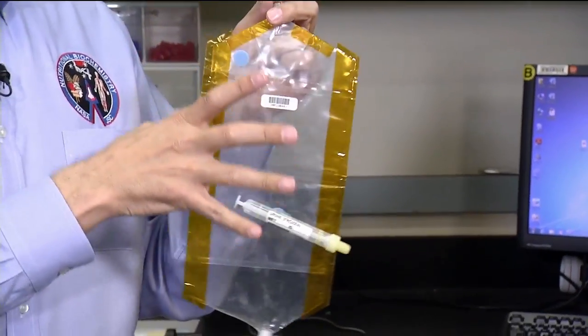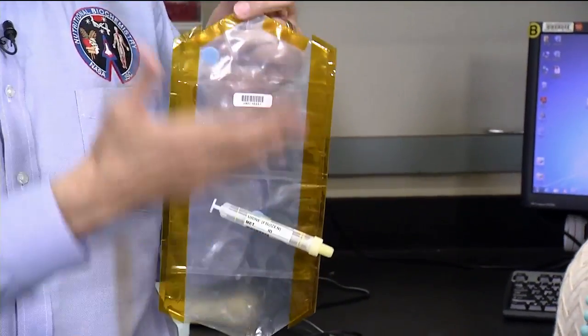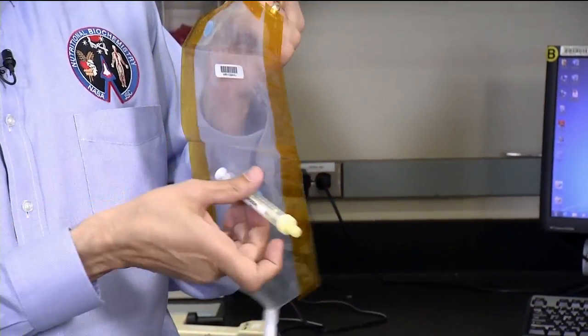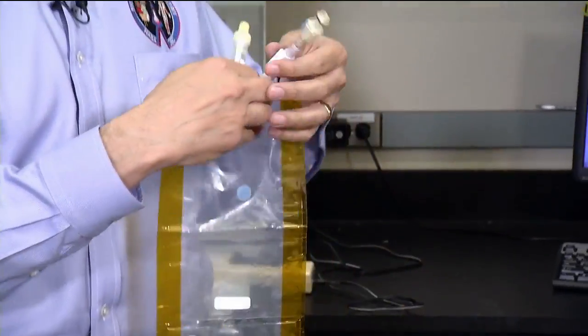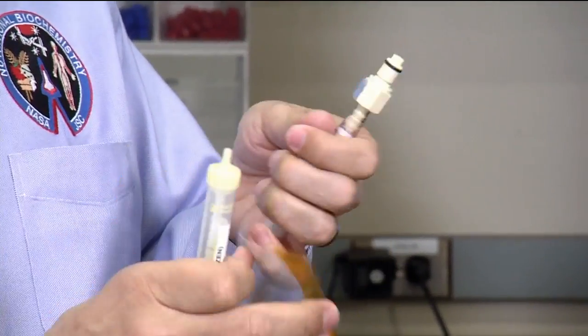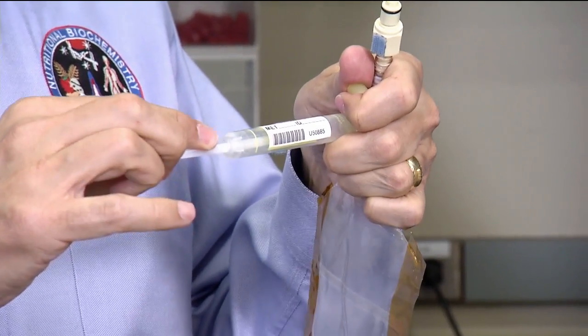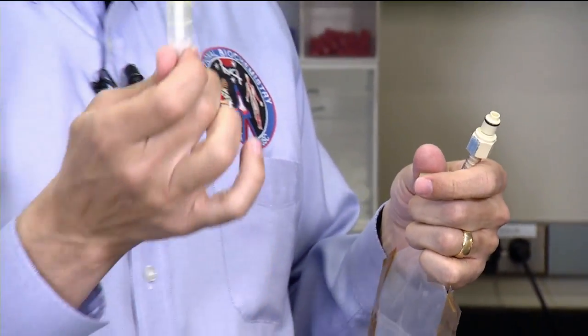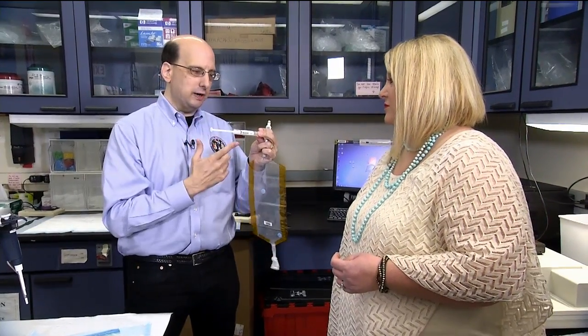We do that in the lab two doors down. What happens is we can't bring this whole bag back, so the crew will void into the bag. They'll mix the urine by pressing on the bag so the lithium chloride gets mixed in with the urine. Then they'll take one of these syringes, and out of the other end of the bag, they will take the lid off the syringe, pop it in this little rubber opening here, and will then withdraw a urine sample. Easy as that. They'll put the cap back on here. This gets pulled out to the end, and then the white piece breaks off.